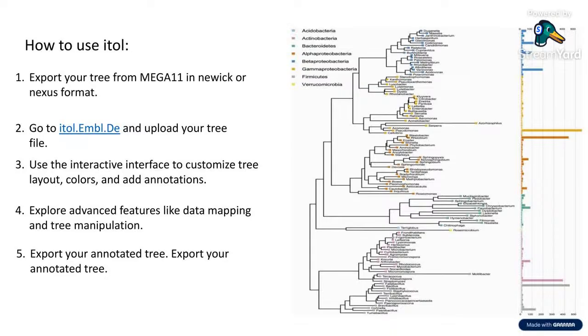This is the overview of iTOL. How do we annotate and add colors and labels, and also rename the nodes or branches with gene name, accession IDs, host species or sampling location, mutation types, or a resistance marker? We can also add pie charts or other graphs to display things such as gene expression percentage or host distribution directly on the tree. For example, each leaf node shows a pie chart representing the proportion of antibiotic resistance.